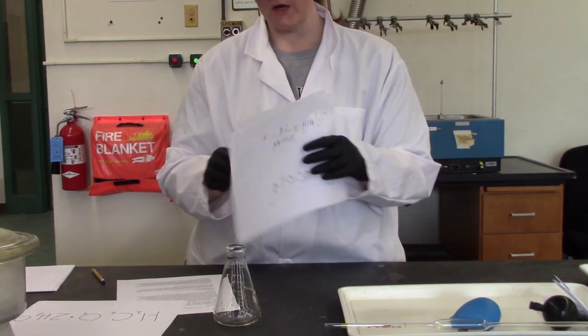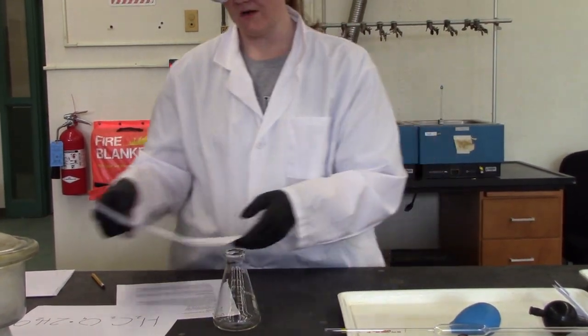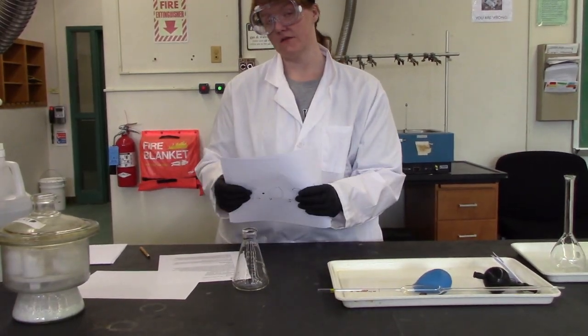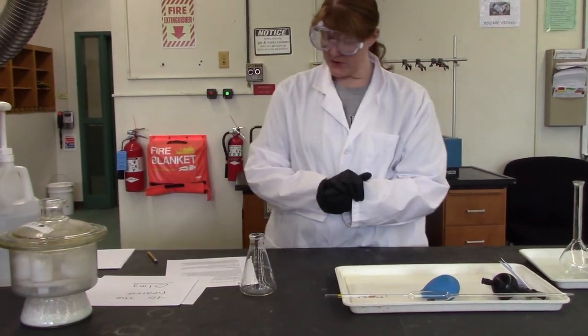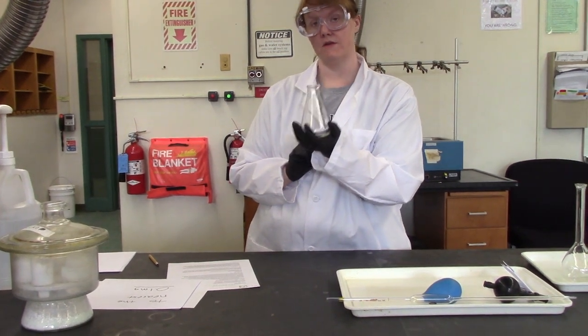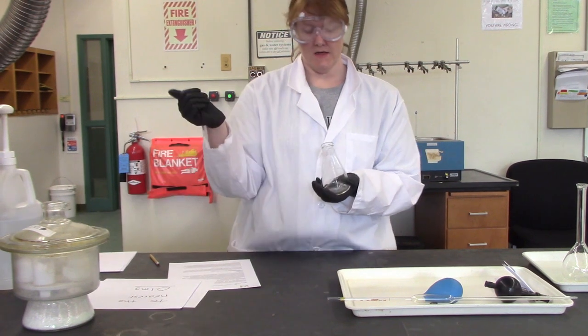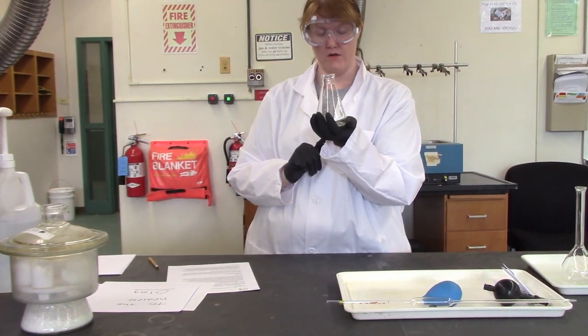You want to make sure that your mass is as accurate as you can make it, as precise as you can make it, because it is your standard. Everything that comes after this is going to be based on that mass. So then the next thing you're going to do is take your flask into the balance room, slide the lid off, take out your oxalic acid, and weigh it out with the tared container on the balance.